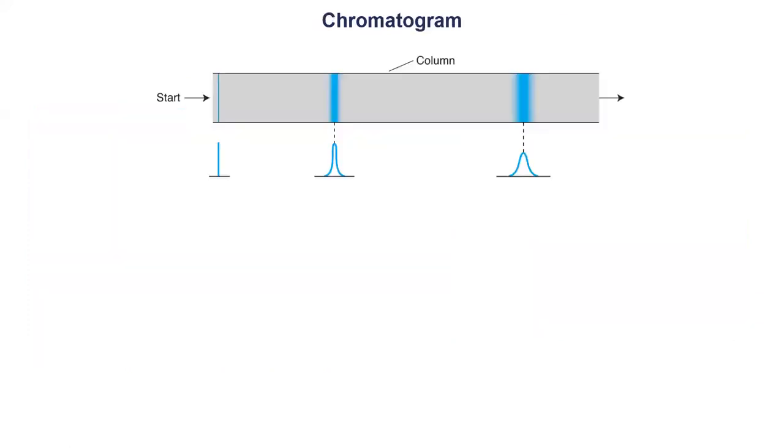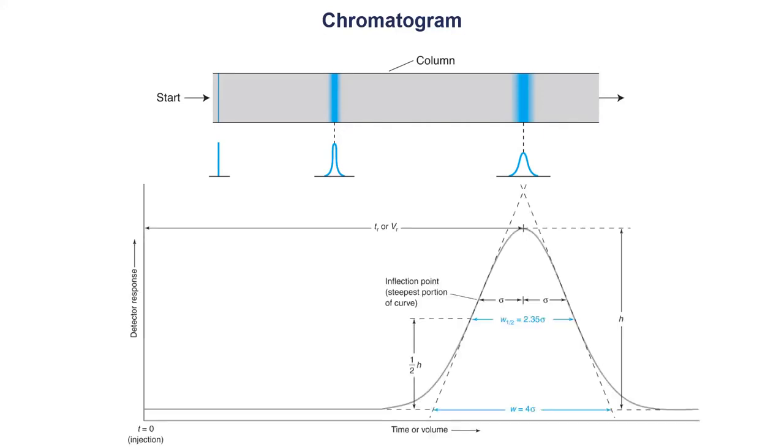And then I already said, so you have a compound that is slower than the other. And if you want to get some idea of how good our separation itself is, we see here that this is completely extracted. And then we can use different parameters of this chromatogram to get an idea of our separation itself. So we have the retention factor.